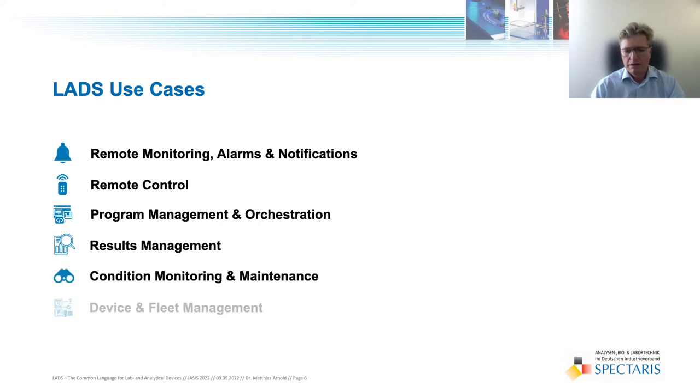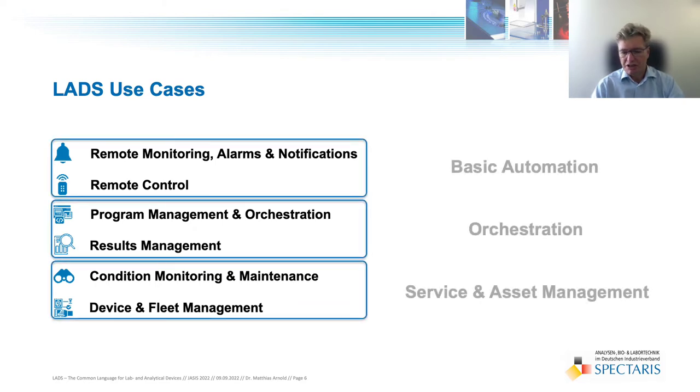Third, the use cases required for asset management, such as condition monitoring, maintenance service, calibration, validation, and so on, are the foundation for business cases such as enhanced serviceability. Put in a nutshell, LADS supports the use cases automation, orchestration, service, and asset management.